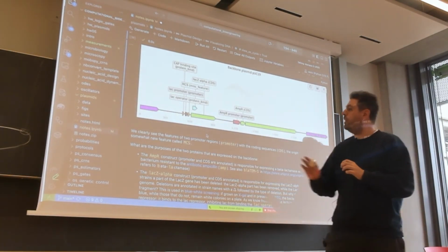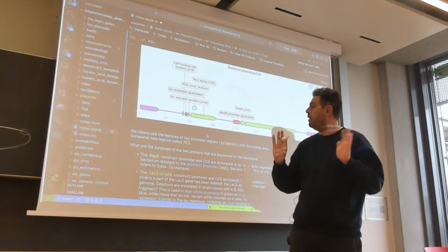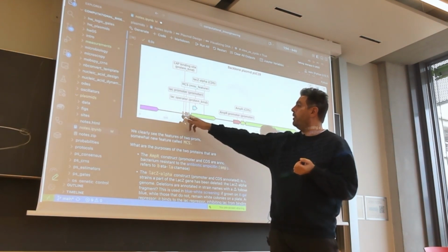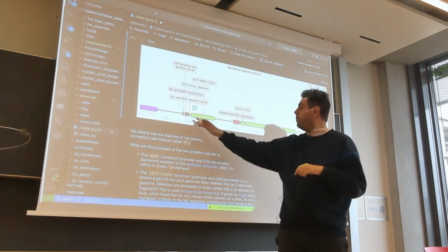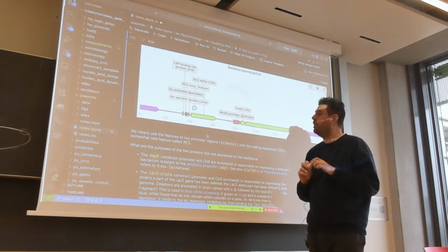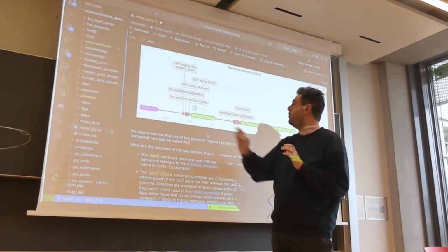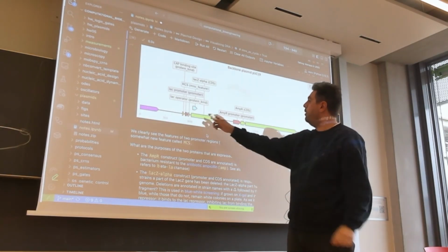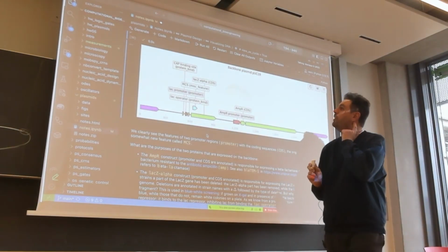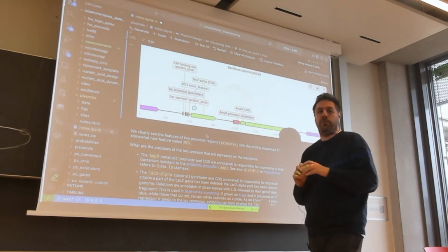Yeah? So in the end, what you see here is you have a promoter, which is in particular very nicely annotated, I have to say, because they even annotated the CAP binding site. You remember it had two binding sites, yeah? The CAP binding site, and here it has the operator for the repressor. So really beautifully annotated, and this is the promoter. What is a bit strange is this thing here, why it's actually lacZ alpha, and that hints that this is a fragment. Yeah? It's not a complete lacZ, it's only a fragment of the protein.